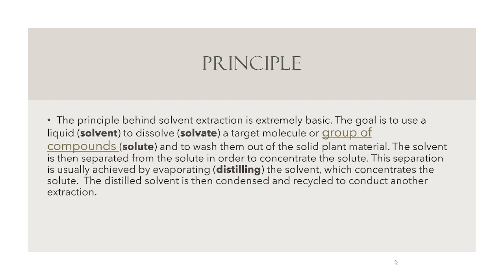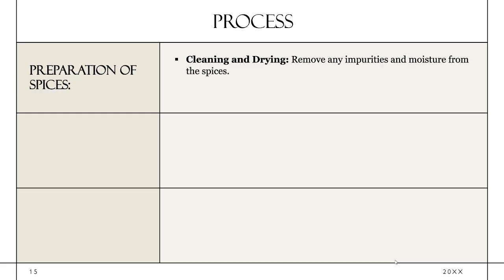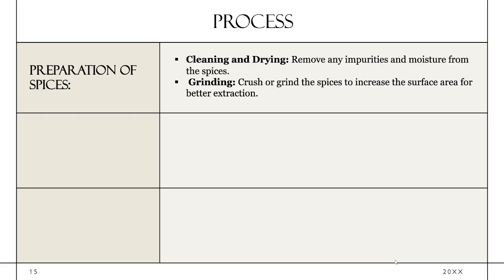The principle behind solvent extraction is extremely basic. It is a process of separation in which a compound transfers from one solvent to another due to its different solubility in an immiscible solvent. What is the basic flowchart of solvent extraction?